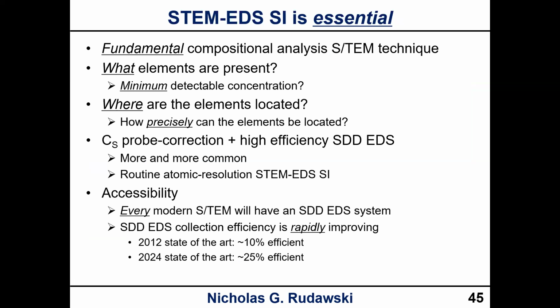If somebody comes in and they're looking for things that are a fraction of a fraction of a fraction of an atomic percent, that, of course, has a limit here. My understanding is, with sufficiently long counting, and there are improvements in the detectors, you can get below an atomic percent, okay? Again, with the right equipment and enough time, okay?